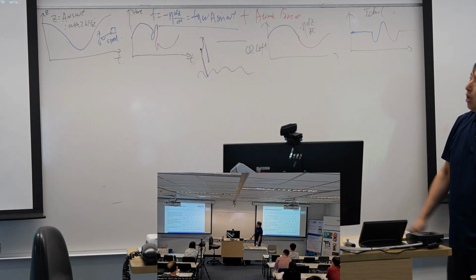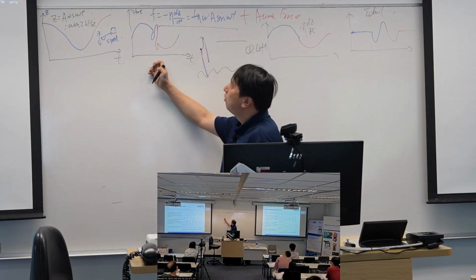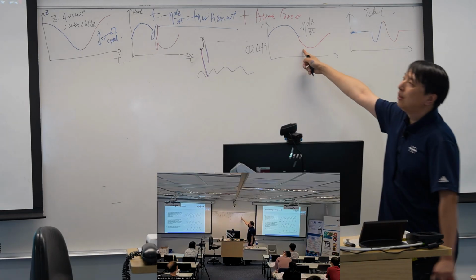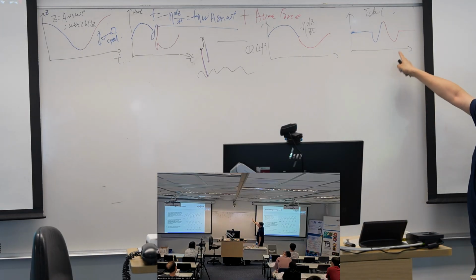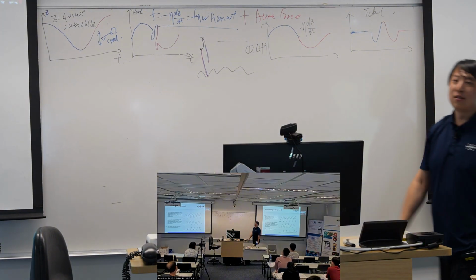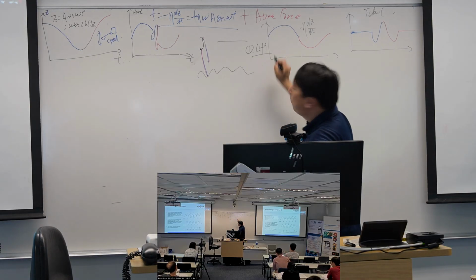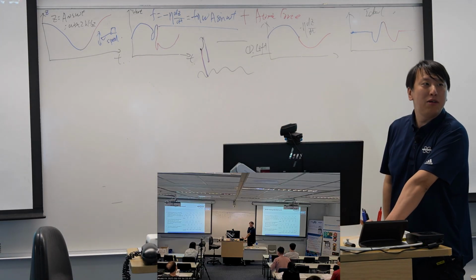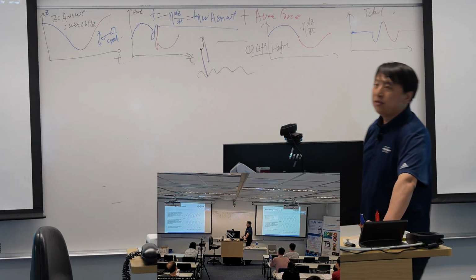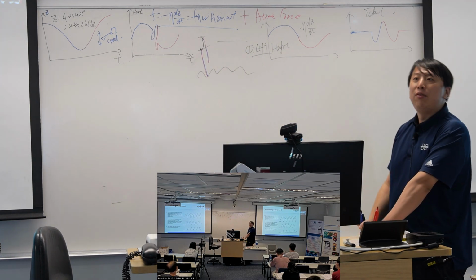And then our software will record this one. And then for the vertical value I captured each time, I subtract the background, and then we can give out the ideal force curve. That's how the software is working in the background, and this one is called the lift. And there is a parameter named lift height. It's used to define how tall you want to lift it up.